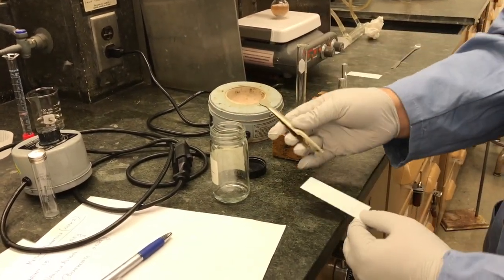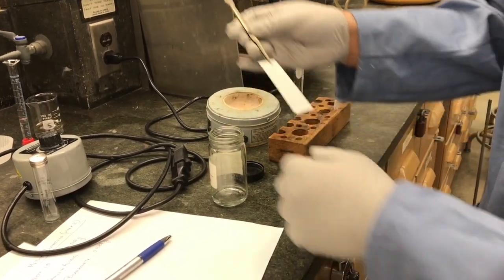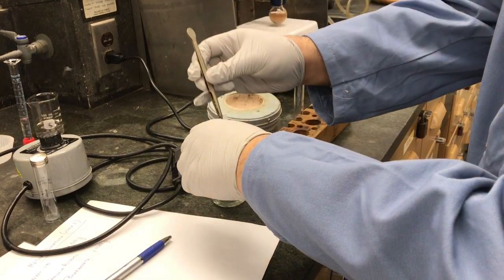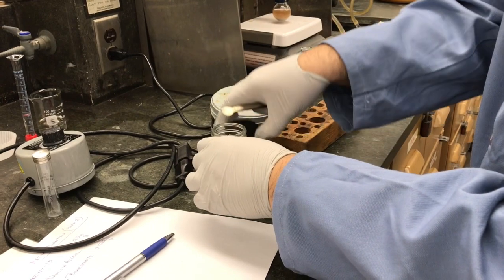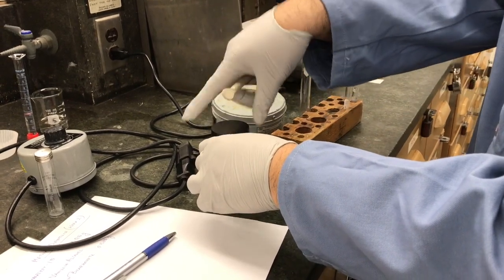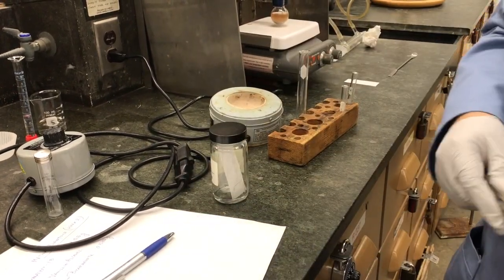And then again, just like last time, we're going to develop it and we'll show you the outcome in the UV, and we'll show you the distances so that you could calculate the RF values. That's it.